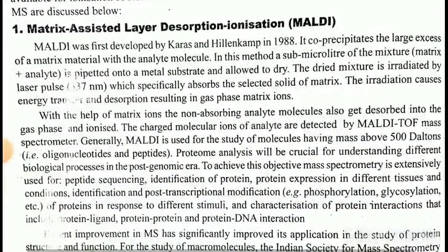The dried mixture is irradiated by a laser pulse of 337 nanometer, which is specifically absorbed by the solid matrix. The irradiation causes energy transfer and desorption, resulting in gas-phase matrix ions. With the help of matrix ions, the non-absorbing analyte molecules also get desorbed into the gas phase and ionized. The charged molecular ions of the analyte are detected by the MALDI TOF mass spectrometer.